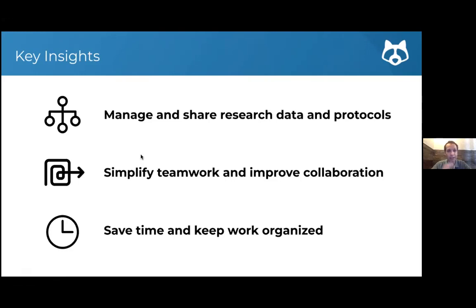And I mentioned the mission of protocols.io, but it's not just about the reproducibility for other people in the published paper. It's not just about what happens in your team after you leave. A big part of what I hope to get across in the introduction is that the goal here is to help you collaborate. It's to save you time. It's to give you more credit for the method development work that you've done.